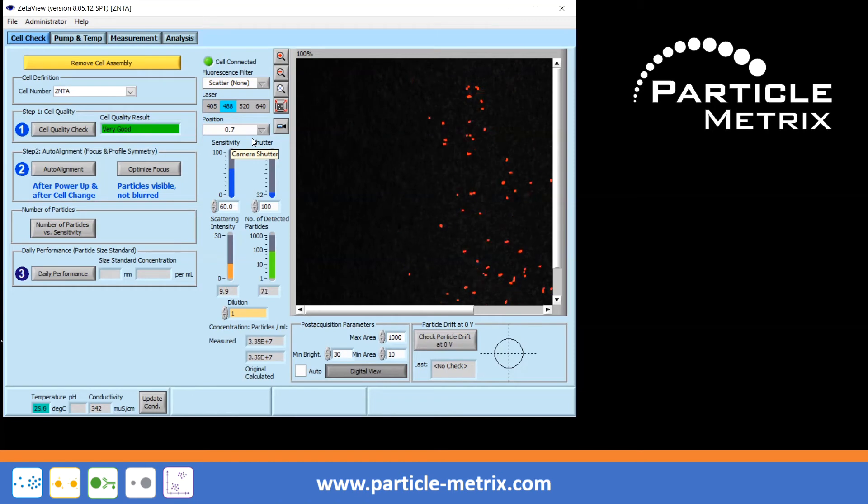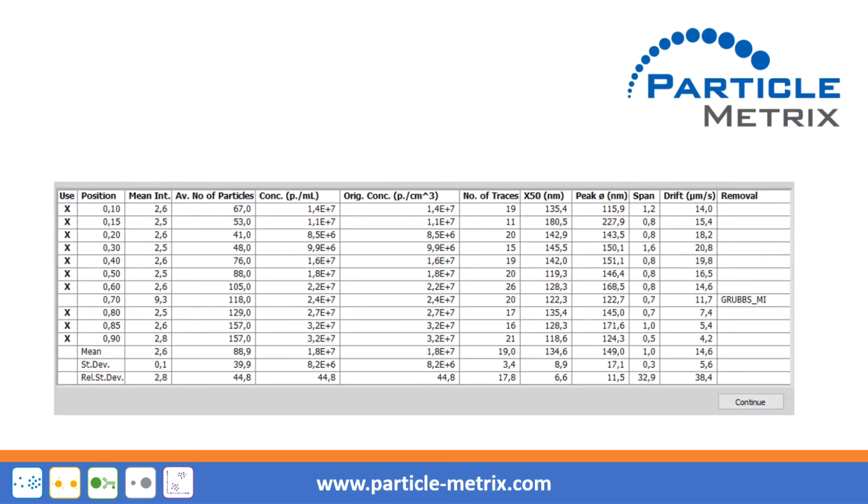If the air bubble cannot be removed in this way and it only occurs in one single measurement position, you can still perform a measurement. The corresponding measurement position is then rated as an outlier in the 11 position table.